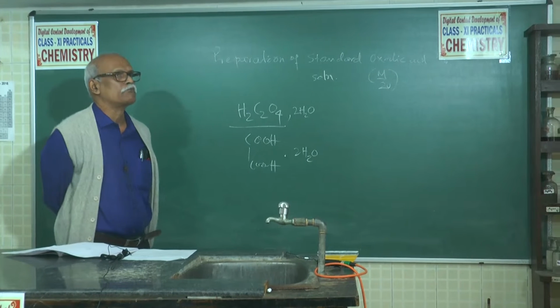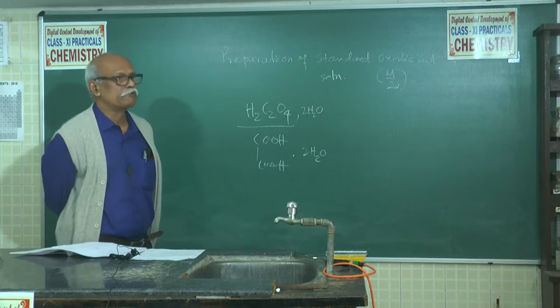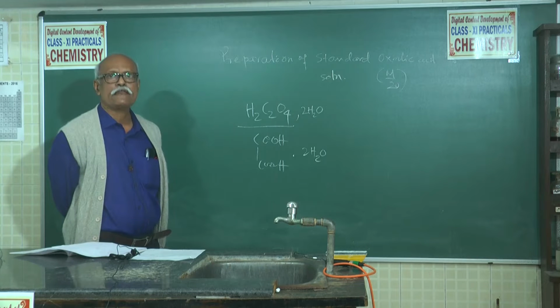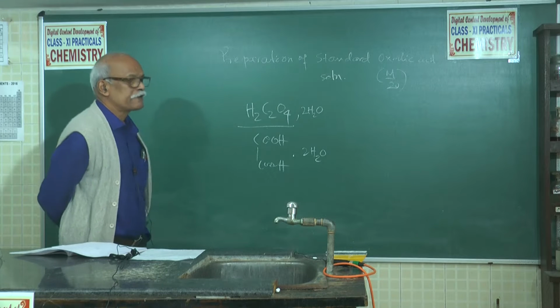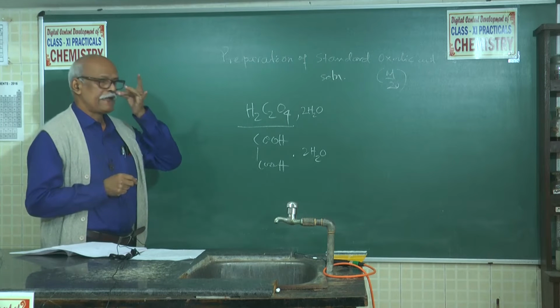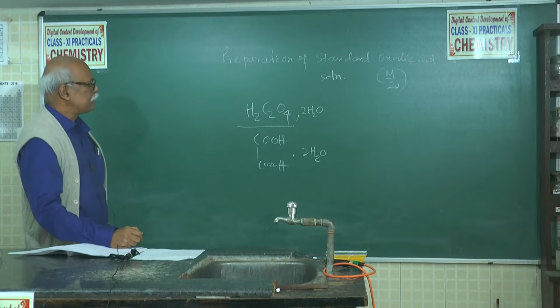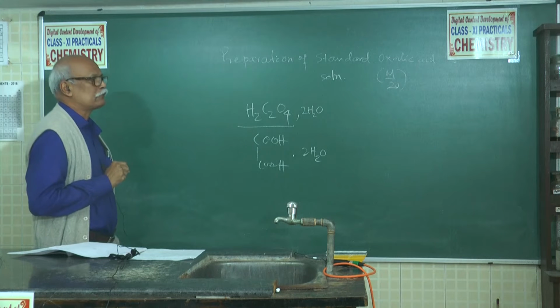Suppose you take sodium carbonate and ammonium carbonate. Sodium carbonate is very much stable, but in ammonium carbonate, even by pressing it, there will be liberation of ammonia. For that reason, ammonium carbonate is called a smelling salt. Remember, ammonium carbonate is called smelling salt. If you are suffering from cold, you take ammonium carbonate in a handkerchief and rub it and smell it. That will be sufficient to eradicate your cold from you. So that is the smelling salt. That will decompose, so ammonium carbonate cannot be taken as a standard solution or primary standard.